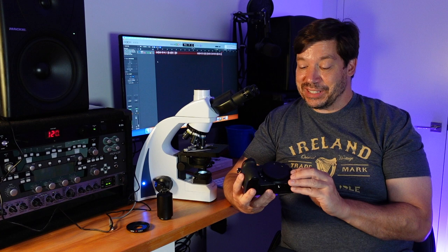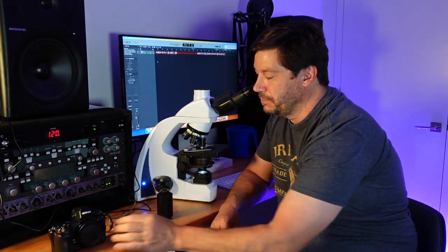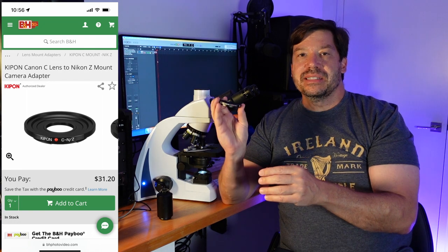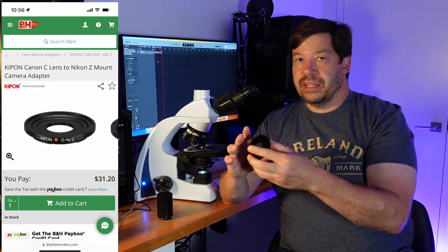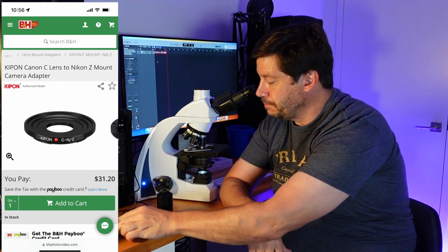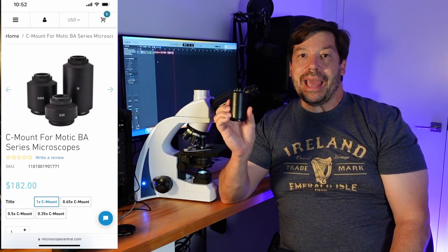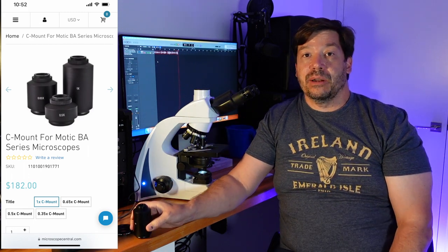Part of the system is a Nikon Z camera. Another thing we need is a C mount for the Nikon Z camera — this is the Kipon C-N/Z, and this basically goes onto the camera just like a lens would. The new thing I've just tried out is a camera tube that is for the Motic BA series of microscopes. I'm going to put all this together and we'll see how it works.